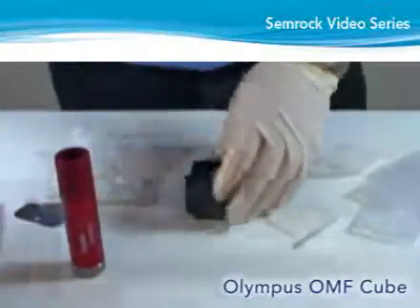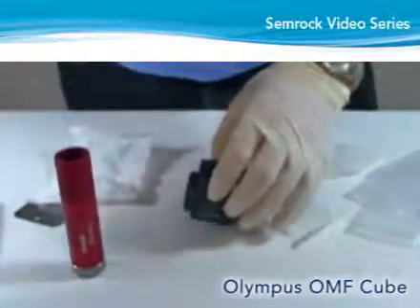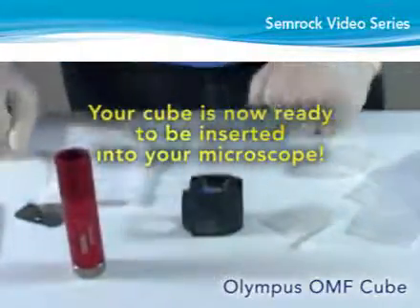Using compressed air, blow off all the exposed filter surfaces. Your cube is now ready to be inserted into your microscope.